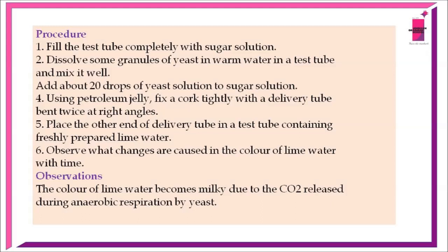Observe what changes are caused in the color of the lime water with time. Observation. The color of the lime water becomes milky due to the carbon dioxide released during anaerobic respiration by yeast.